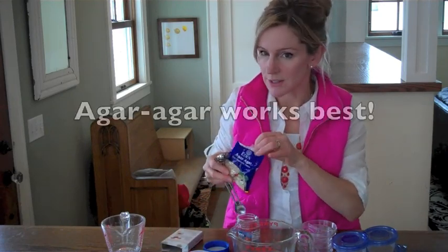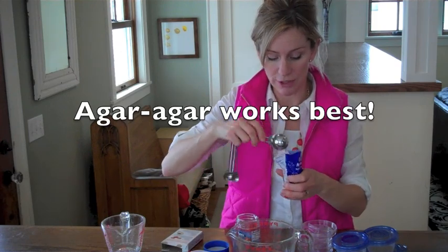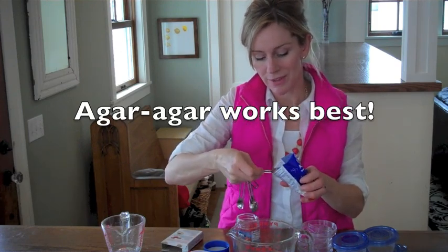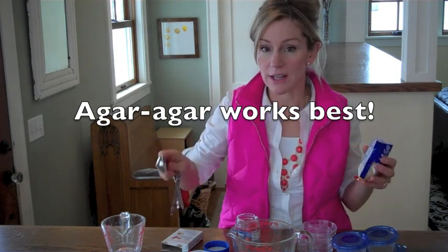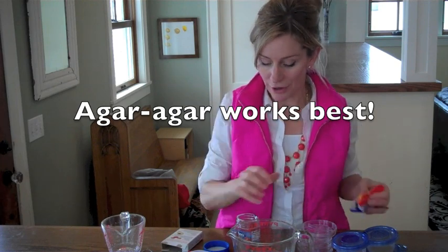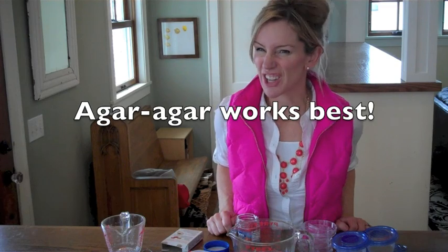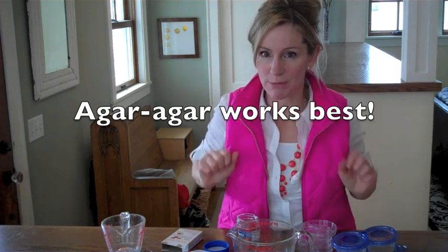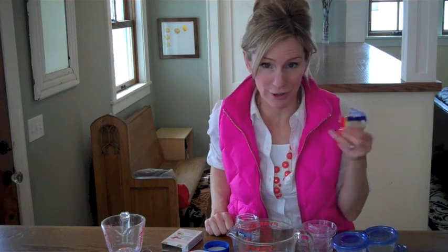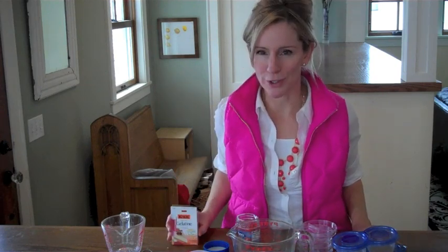Agar-agar is made from algae. You can find it in the Asian section of a number of grocery stores. The great thing about agar-agar is that unlike gelatin, it won't melt at high temperatures. Agar-agar also isn't broken down by some microorganisms. Gelatin plates can get broken down by bacteria and actually sort of liquefy. So if you can find it, agar-agar is fantastic. If not, you can go with gelatin — it will work just fine.